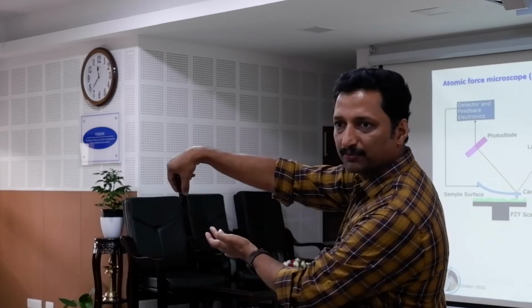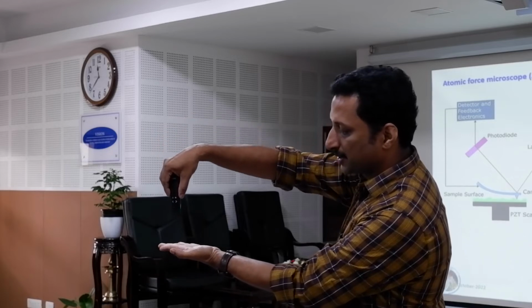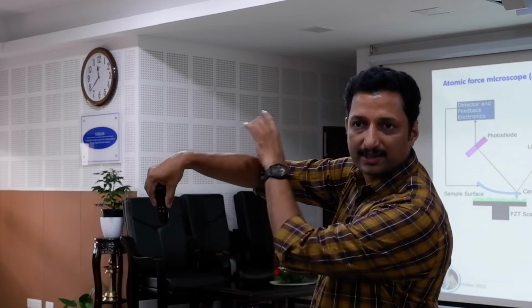The deflection is proportional to the spring constant of this cantilever. Basically, if it deflects, the force is measured as F = -kx, where x is how much I am pulling and k is the spring constant. So if the tip is coming closer and closer, and the surface atoms exert a force on the tip, it will deflect. And how much that force is, I can know exactly if I know the spring constant of this cantilever.